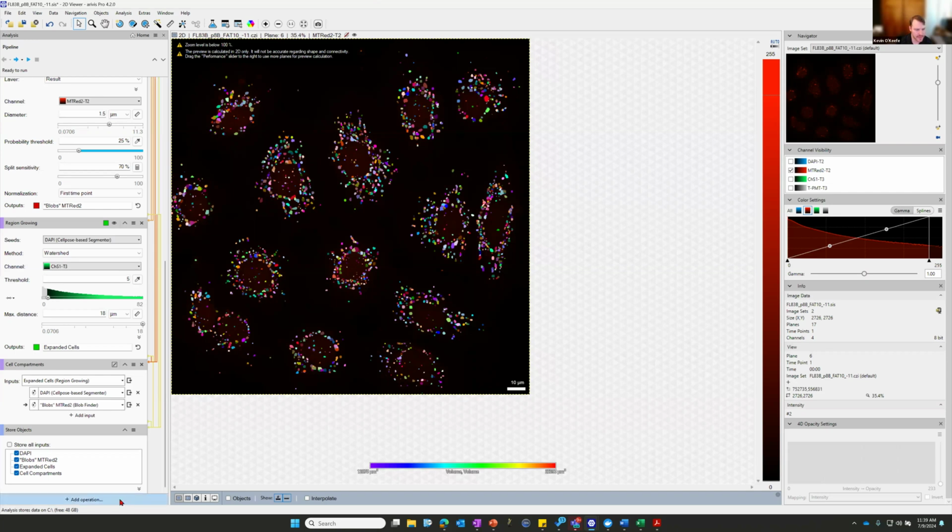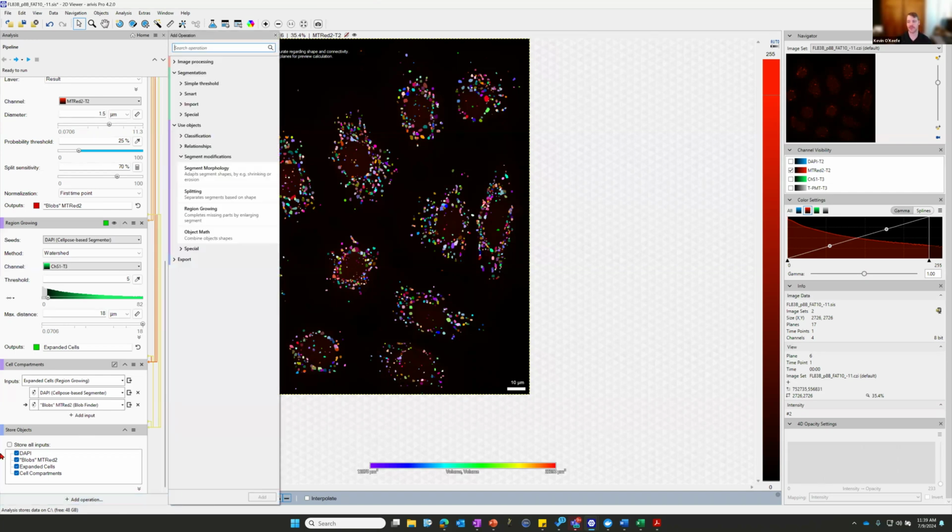Okay. And the last thing I'll talk about before we transition for the last 15 minutes into Arivis Cloud. Then I have a couple of minutes after the hour for any specific questions. If we don't finish by 12, I can stay a little bit later. The last thing I want to point out in this analysis panel in Pro is there are 4 main steps when running a pipeline. And you're always going to run them sequentially.